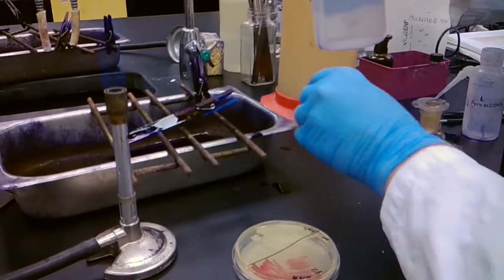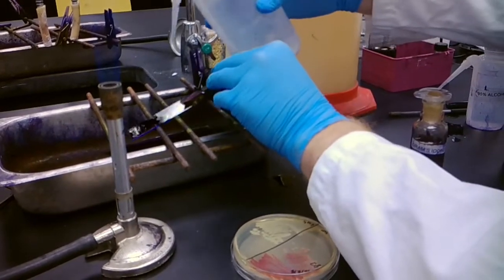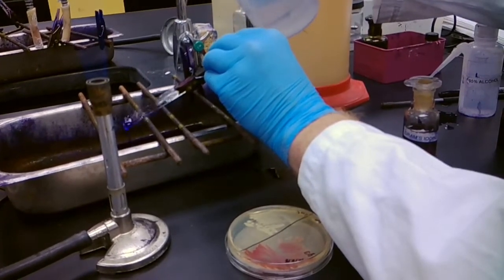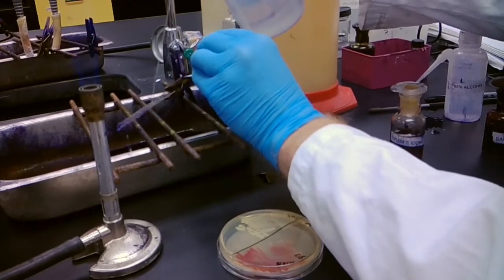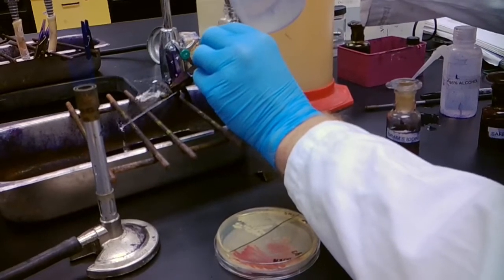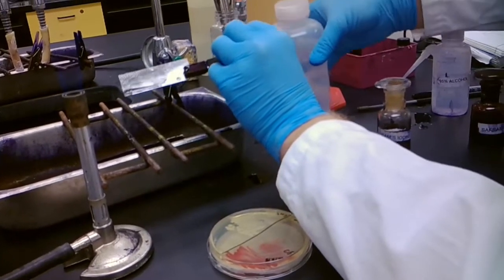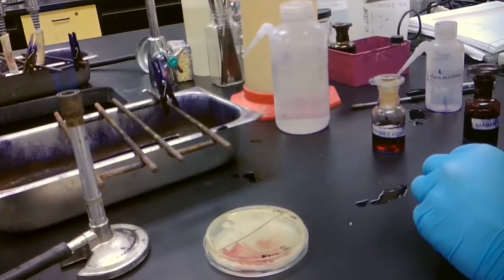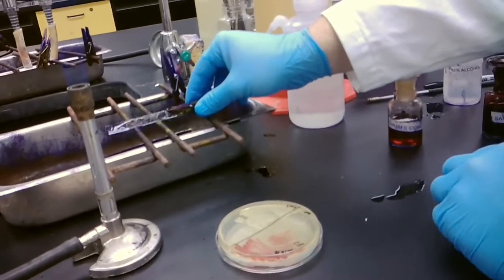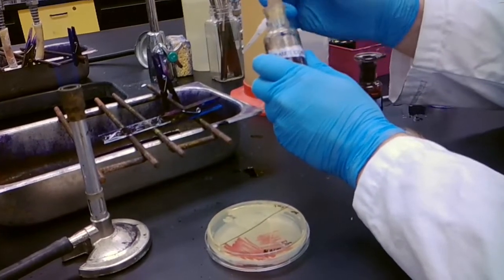So now what we're going to do, after about 30 seconds, is take our distilled water and rinse out all of the crystal violet. Doesn't look like anything's still there. Oh, no, there is. Good. Okay. Once we've rinsed off the crystal violet, we'll now apply gram's iodine.